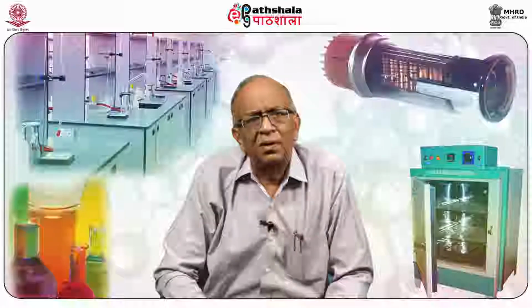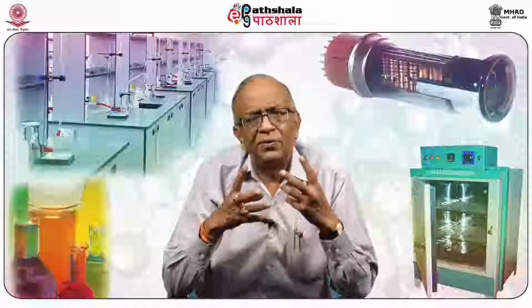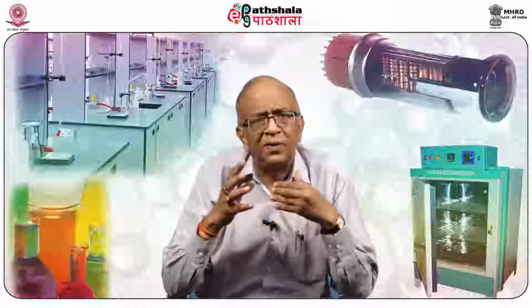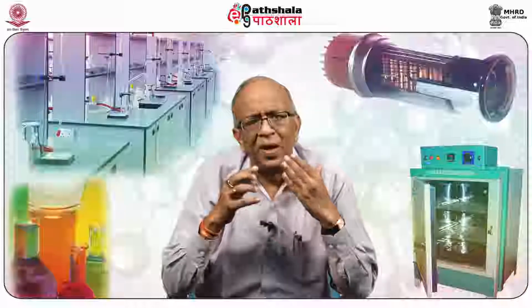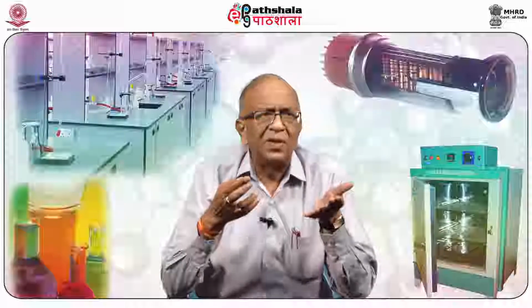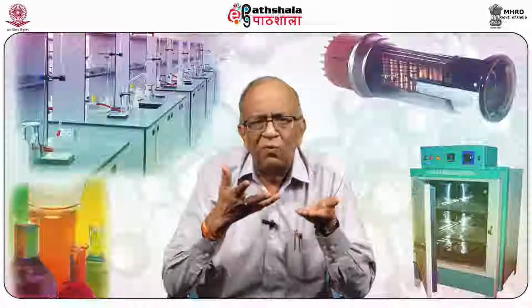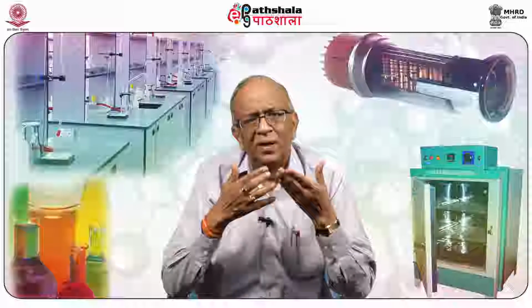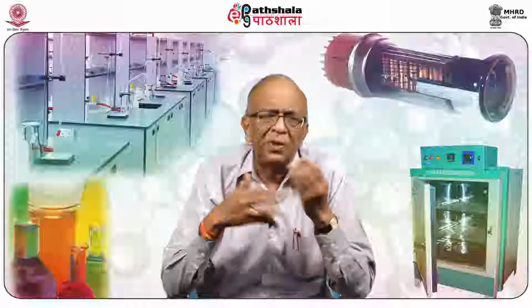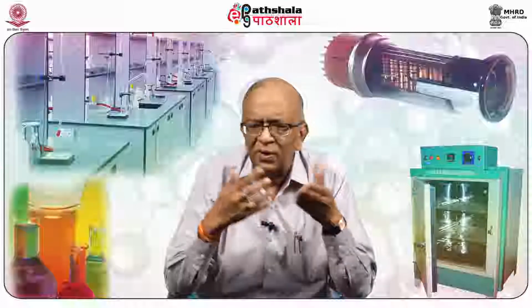When matter is heated, it undergoes certain physical and chemical changes. These take place over a wide temperature range. As in the case of boiling of water, certain changes take place at 100 degrees, when it is converted into vapor, and if it is cooled, it is converted into ice.